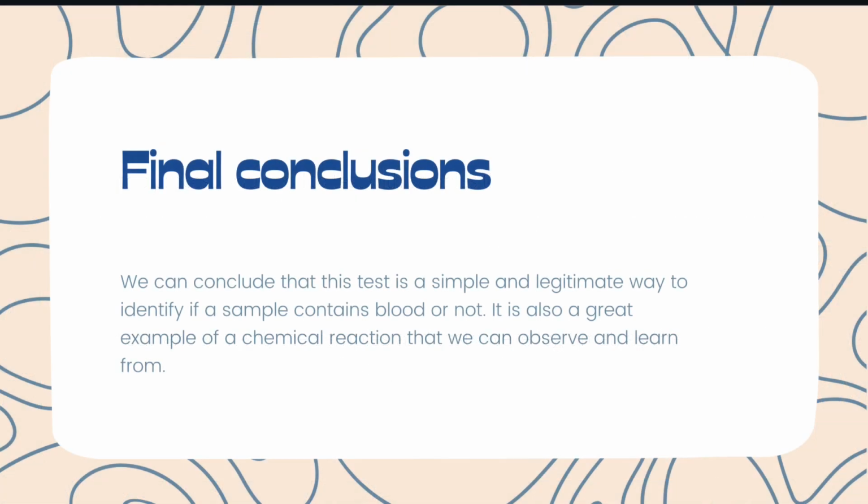For our final conclusions, we can conclude that this test is a simple and legitimate way to identify if a sample contains blood or not. It is also a great example of a chemical reaction that we can observe and learn from.